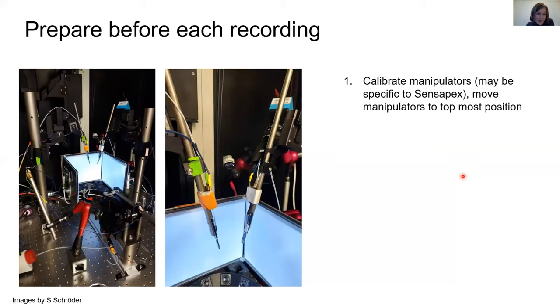Before each recording, you do the following. First, we used to calibrate the manipulators. This may be specific to Sensapex, but probably it's the same for lots of manipulators. Then you position them at the topmost position. Then you place the probes into the manipulators. You could do this before, but for the calibration, the manipulator actually moves around, so it's more likely that you have collisions between the probes. So I would do it before placing the probes into the manipulators.